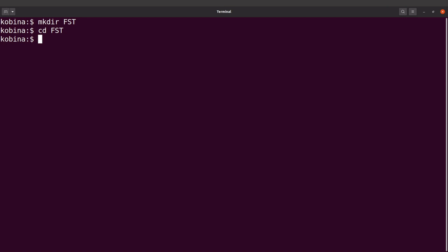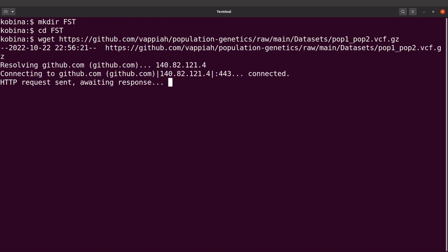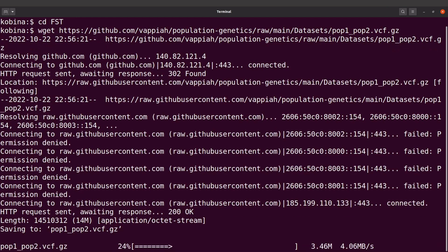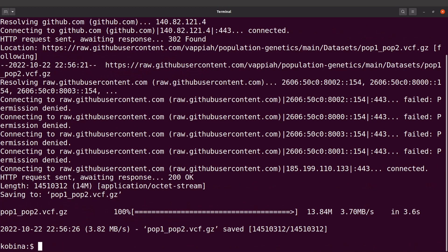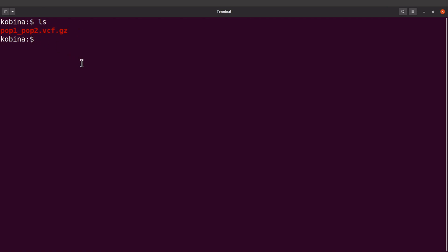So I'll say wget and I'll supply it with the link to the file, the VCF, which is here. And then I'll download it. Okay, so download has been done. Let's check the file. So if I do an ls I'll find the file here. So this is the VCF that I'm going to use. Perfect.